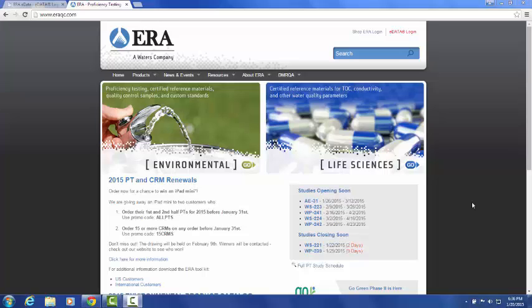The webinar is part of a larger program to help our customers make a smooth transition to using the new system. Additional resources and how-to information to help you navigate eDATA 2.0 will be available on our website www.eraqc.com when the new system launches on February 16th.